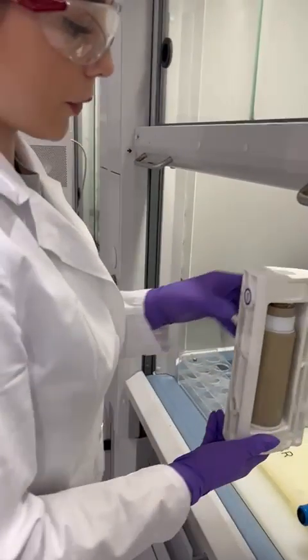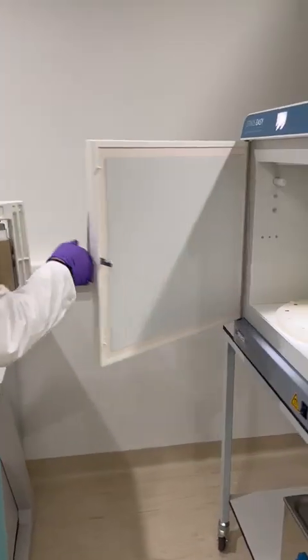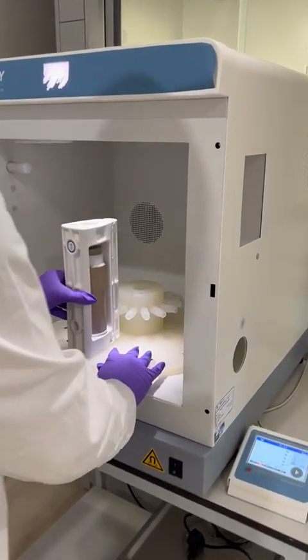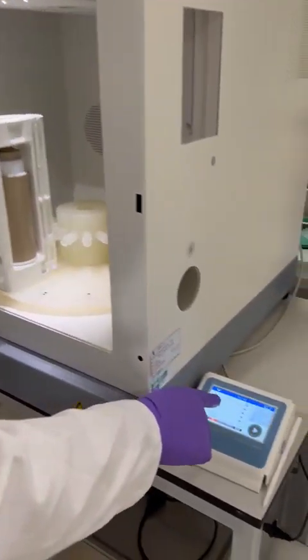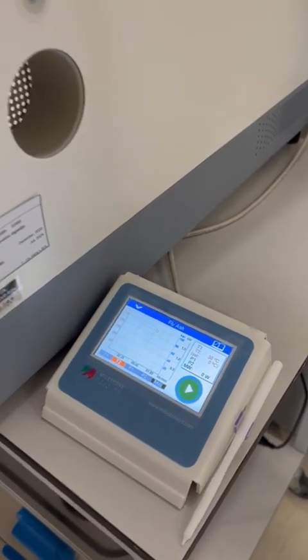After this step, we are putting the vessels into our microwave digestion instrument. As you can see, the instrument is already set to the fly ash method, which we are using for the digestion program.